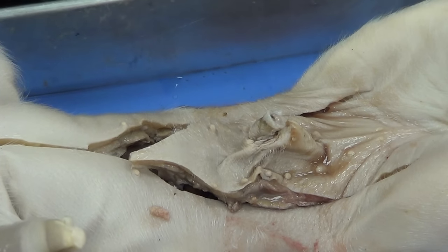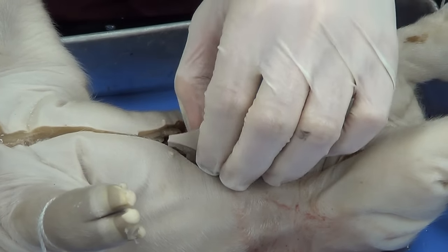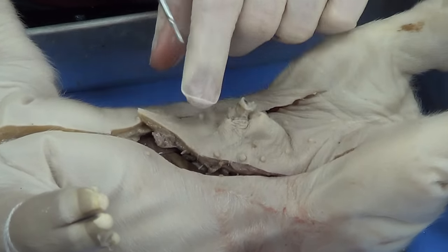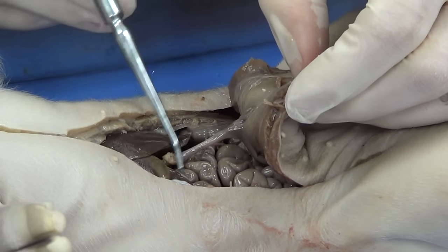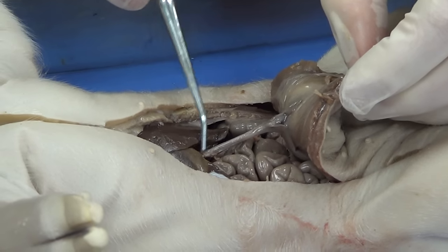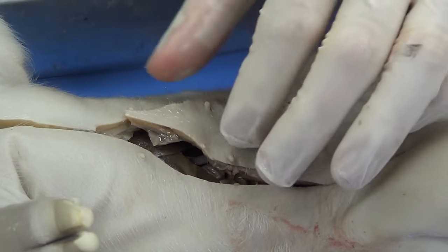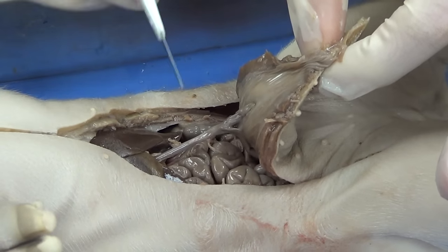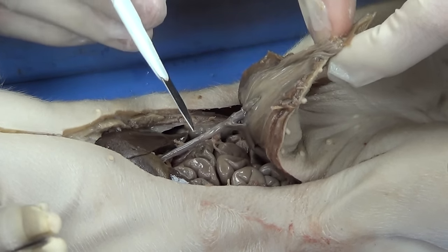I'm going to take a paper towel and clean up some of this liquid so we can see what we're working with. I'm going to reflect the skin here — here's the umbilicus. When I reflect the skin, you can see this blood vessel right here. That blood vessel that runs from the umbilical cord to the liver is going to be the umbilical vein.